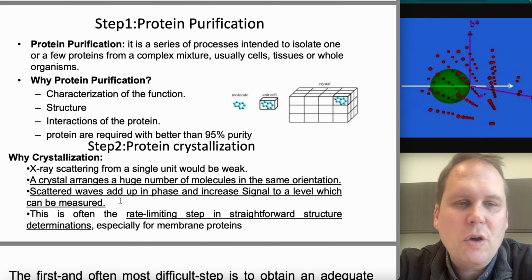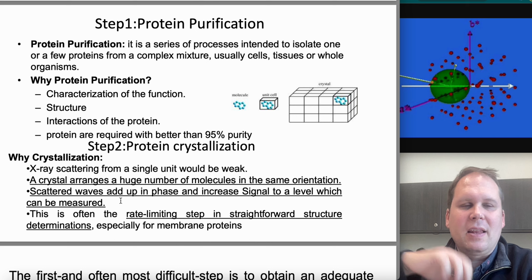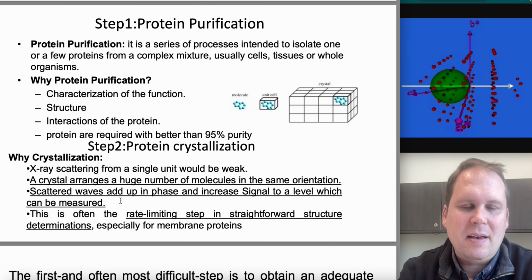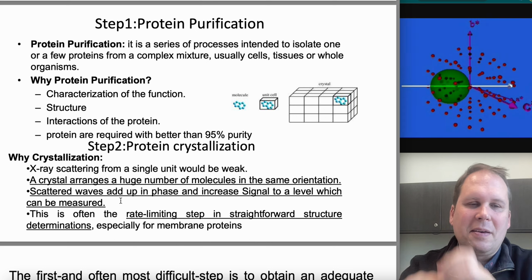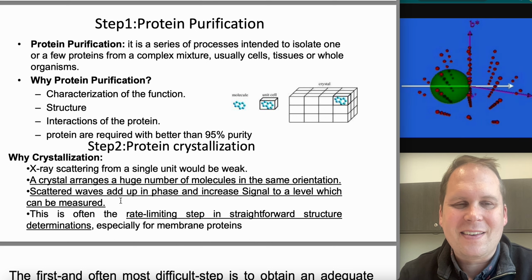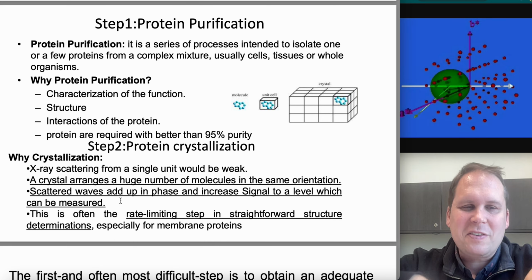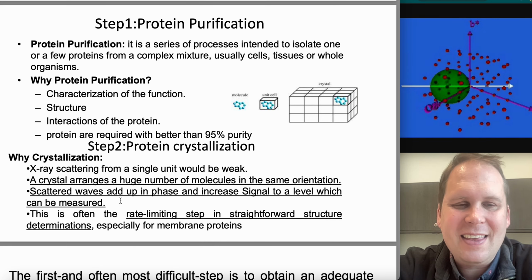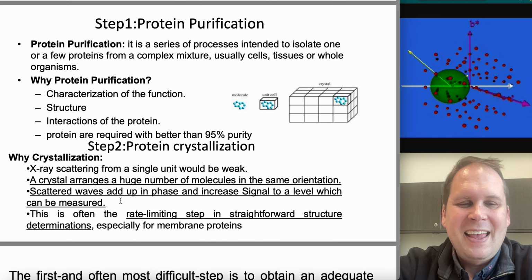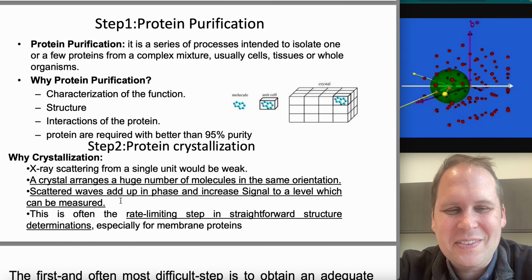So they'll wrap around cobalt or zinc ions, for example. And so you can have a column that has immobilized metal ions on it. All your proteins will stick to the little immobilized cobalts or zincs on there. Then you can put in another chemical, something like imidazole, and wash them all off. And then you can try to refold them just by taking away the denaturant you put on. And who knows? You might get a purified protein.